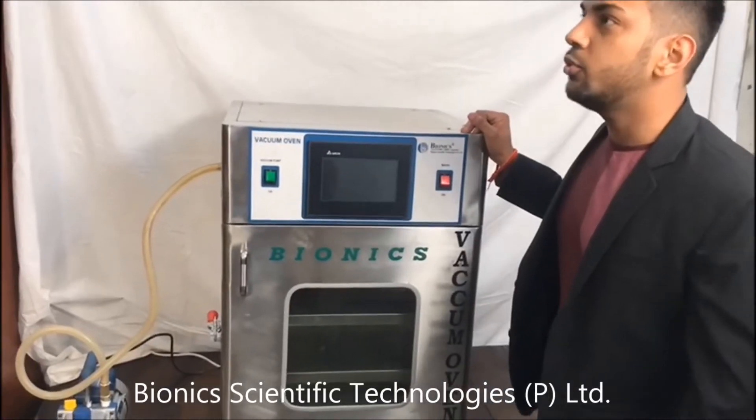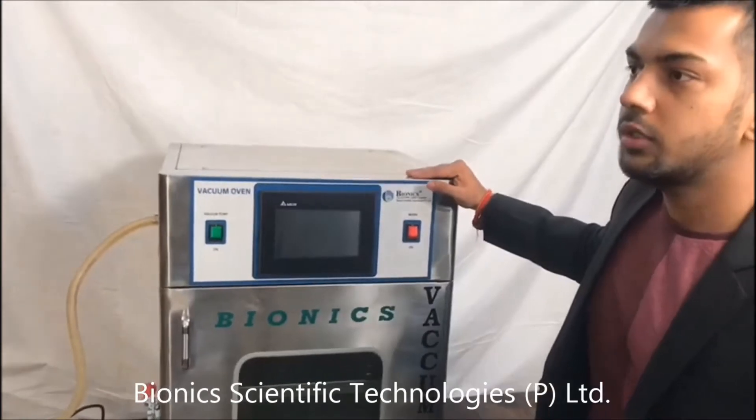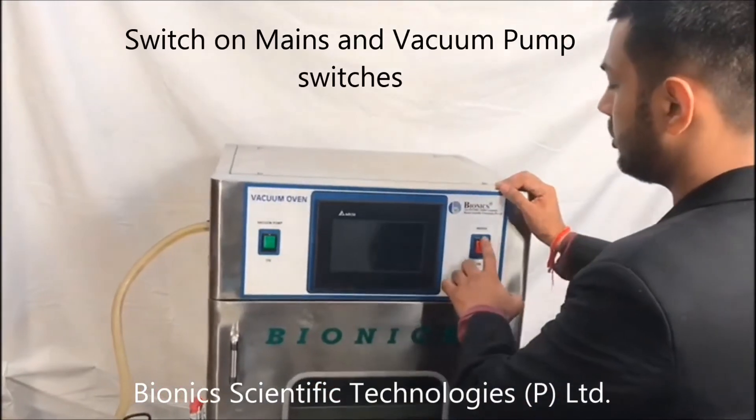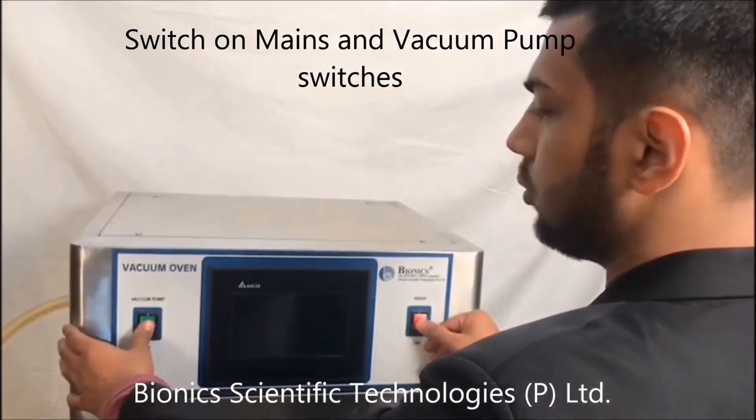Now I will tell you how this machine is demonstrated. First, what you will do is switch on two switches. This is the switch, and this is the vacuum pump switch — we will switch it on.